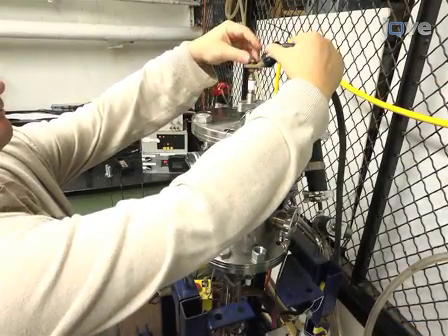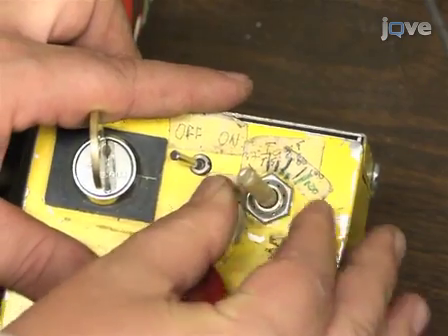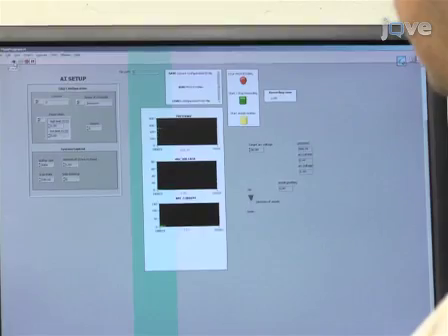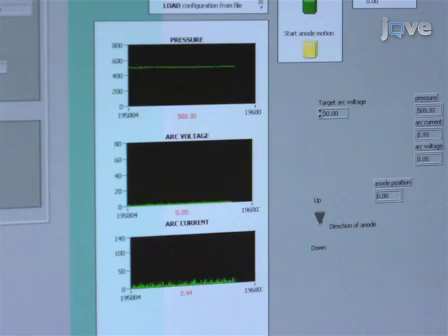Connect the arc electrodes to a DC welding power supply and set the power supply to an arc current of about 75 amps. Record the real-time values of arc current, arc voltage, and chamber pressure for post-experimental analysis.